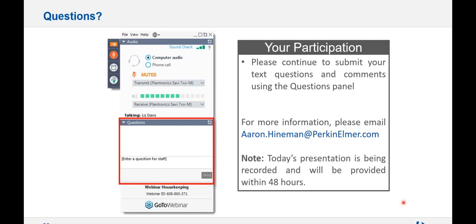All right, Sarah, we've got our first question here. I've got some contamination using a 2 gram per liter magnesium nitrate matrix modifier for my aluminum determination. I've already changed to a pre-mixed solution from PerkinElmer. It's gotten even worse. Do you have any clue how I can fix this blank problem?